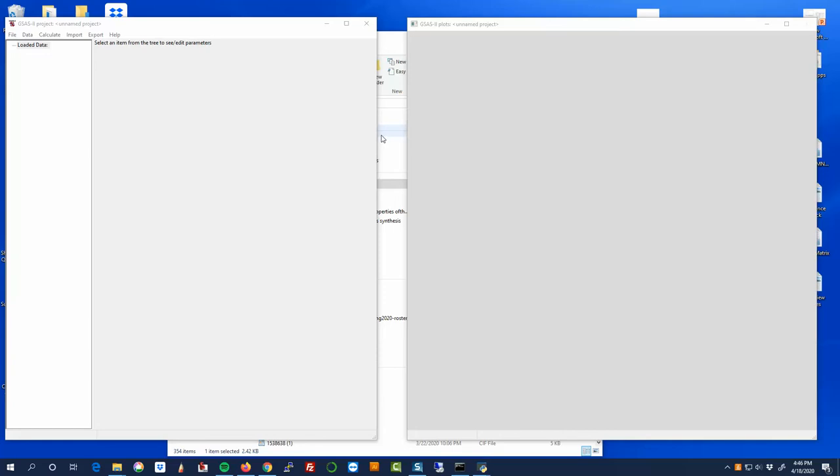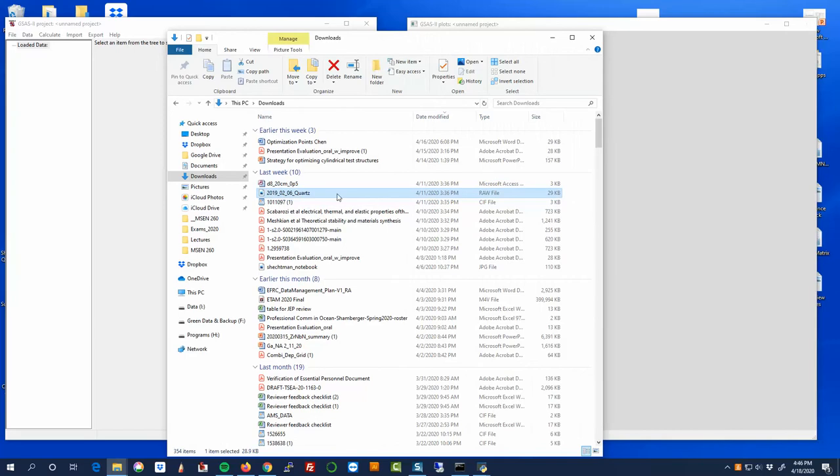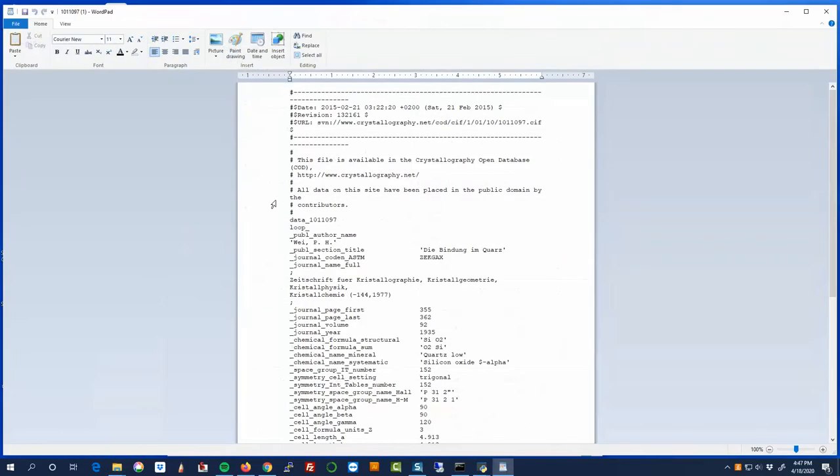Howdy. We're going to try again. We're going to try and do our first refinement with GSAS2. So I've just opened GSAS2, and what we're going to work with today is an example of quartz data. So I've downloaded a .raw data file. .raw is a Bruker commercial binary data format. And I've also got the CIF file in hand here.